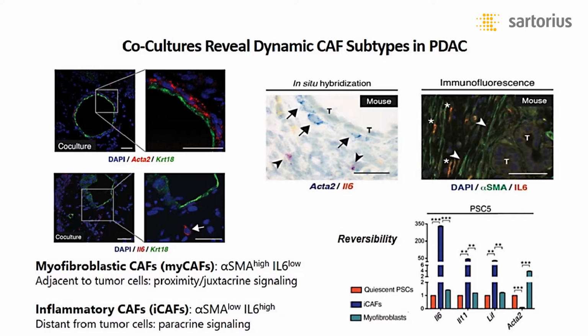We never would have found any of this if we hadn't made the organoid cultures in the first place and done these add-back experiments. And I think it'll be really cool for when Keith starts to do experiments like this in the brain, because no cancer happens in isolation. There's a cell that acquires mutations, but the initiation and progression of that cell is highly dependent upon the tumor microenvironment. And again, these types of experiments are very challenging to address.